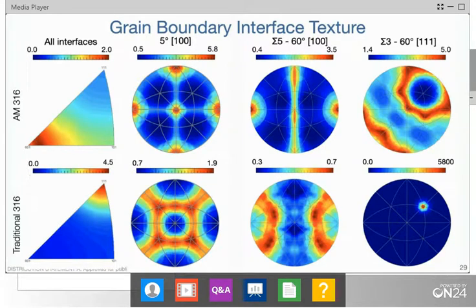So, all right. There's a question: how does NLPAR impact other measurements like CAM or GOS? Those are things we have not researched extensively yet. Everything that I've looked at, at least qualitatively, shows that you have a sharpening of the information.